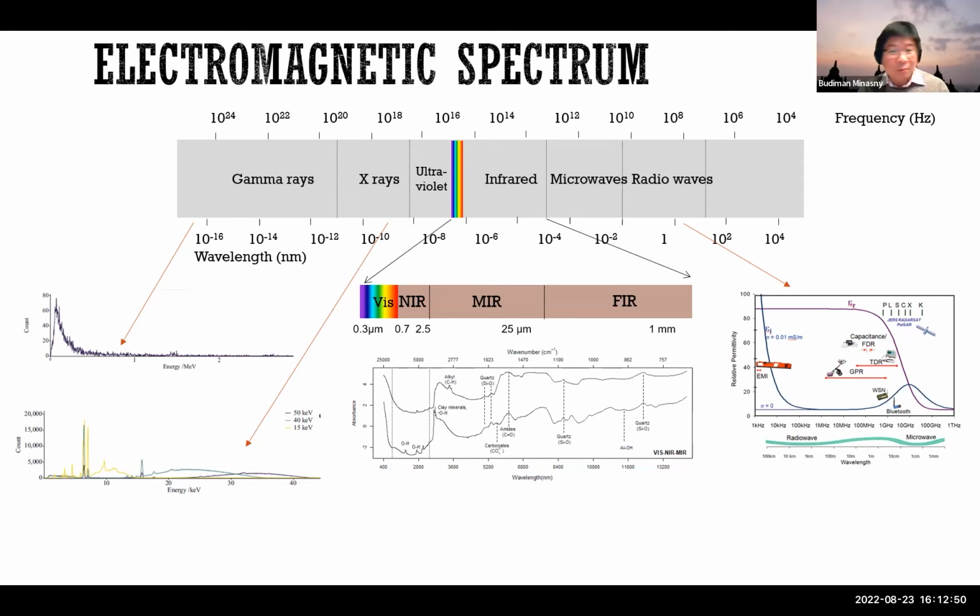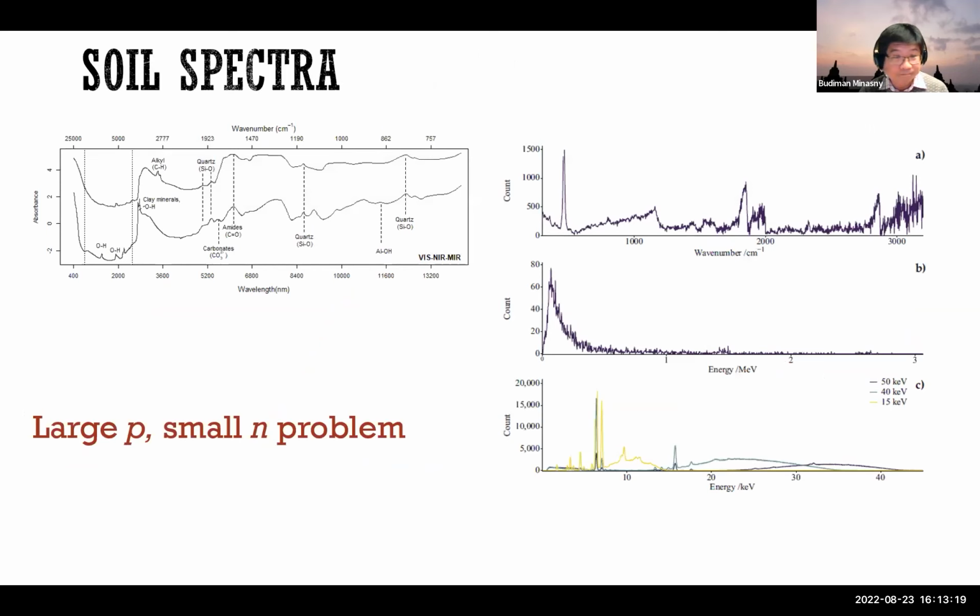And further down, up to the gamma ray, we are talking about natural emission of the gamma spectrum. We can also detect the amount of mineral components of the soil. So we will present more about the infrared spectrum, but the spectrum of the soil is a more general topic, available from the whole electromagnetic spectrum.